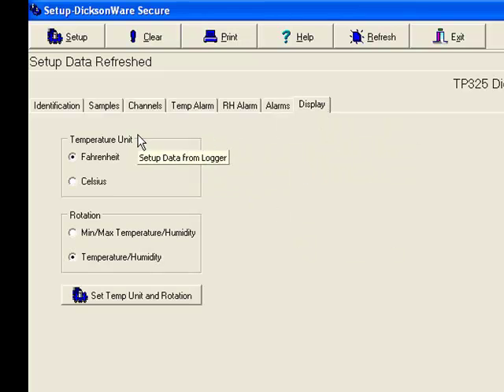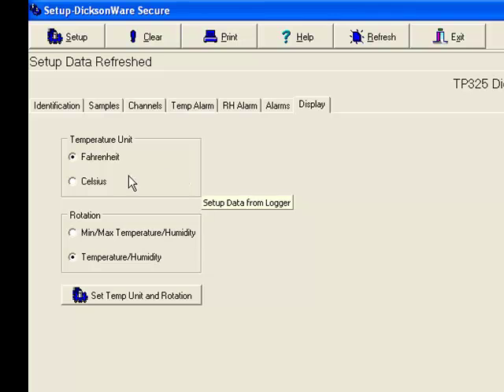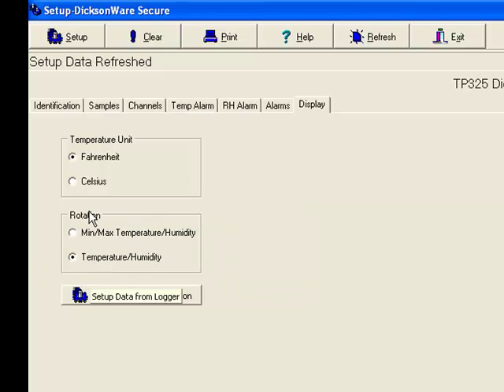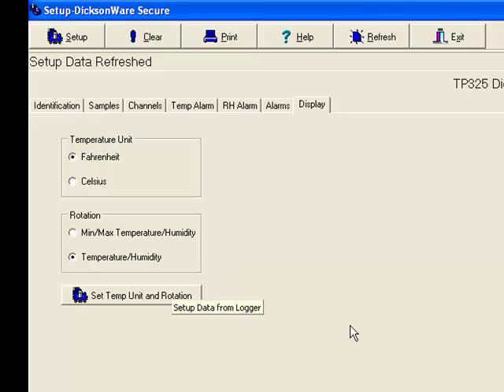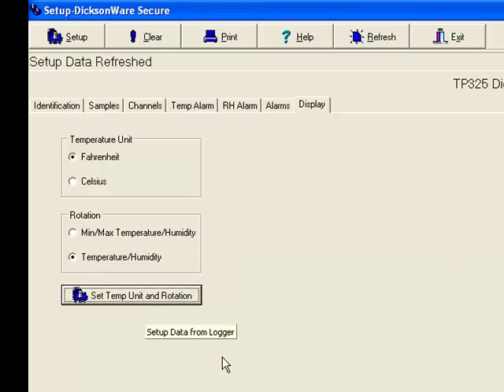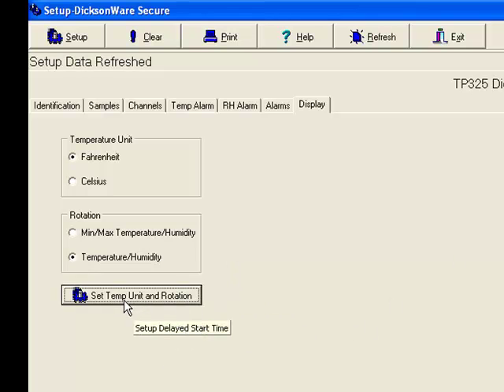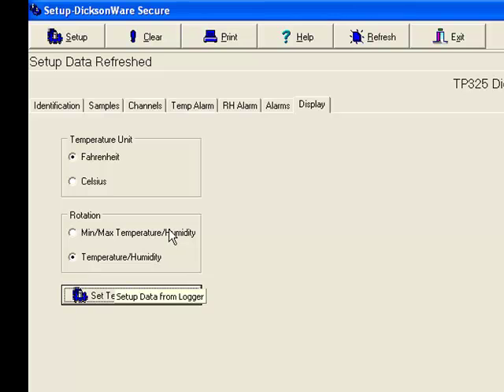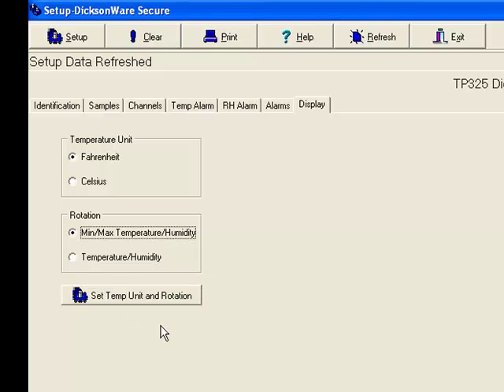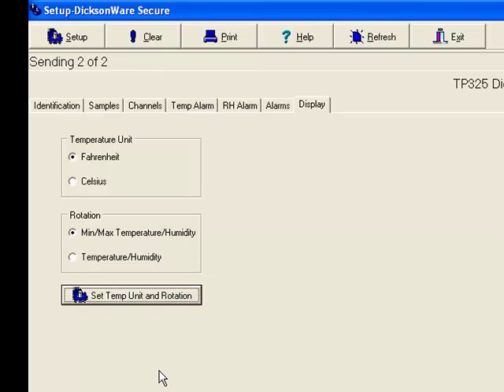You can change the units from Fahrenheit to Celsius. You can change what it's rotating, what it's showing you. Clicking this button right here allows you to update this information on the unit. So, if I change something, you have to click Set Temp Unit and Rotation.